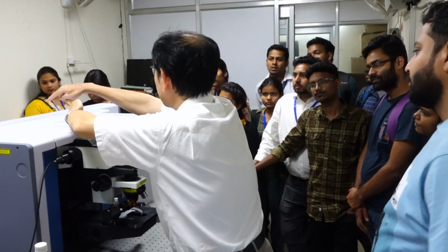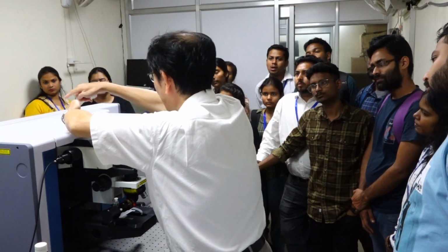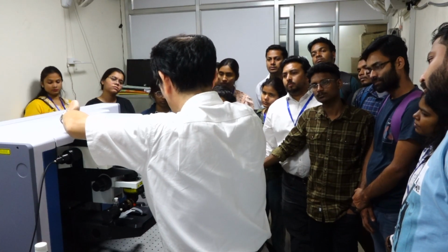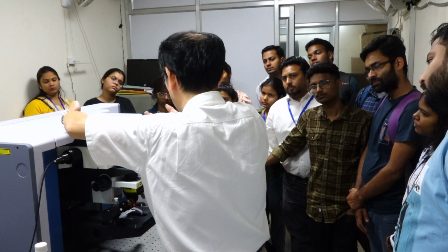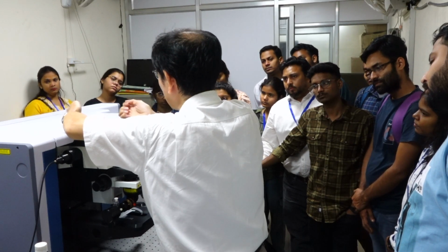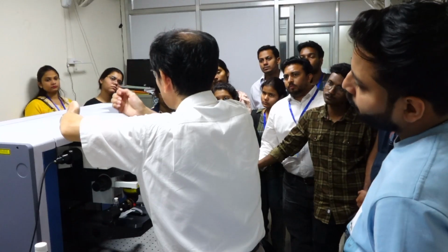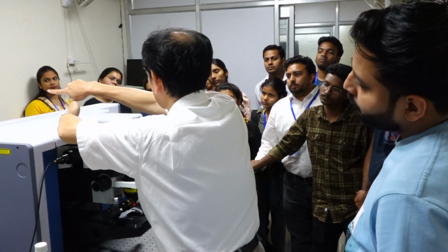633 comes, and this is transparent for 633. So it passes through and focuses onto the sample. Then the backscattering component, including the Raman signal, comes here. Then for 633, it is transparent, so the Rayleigh line goes straight.